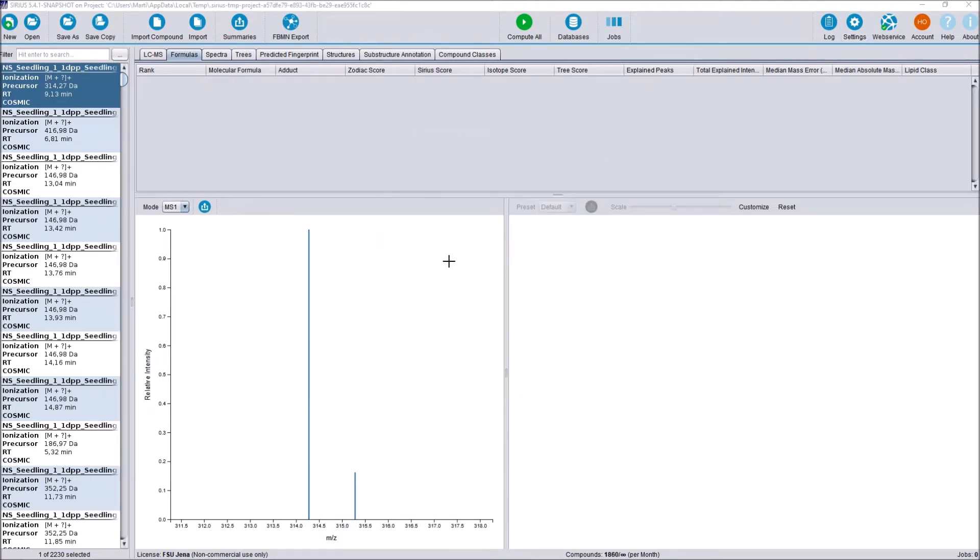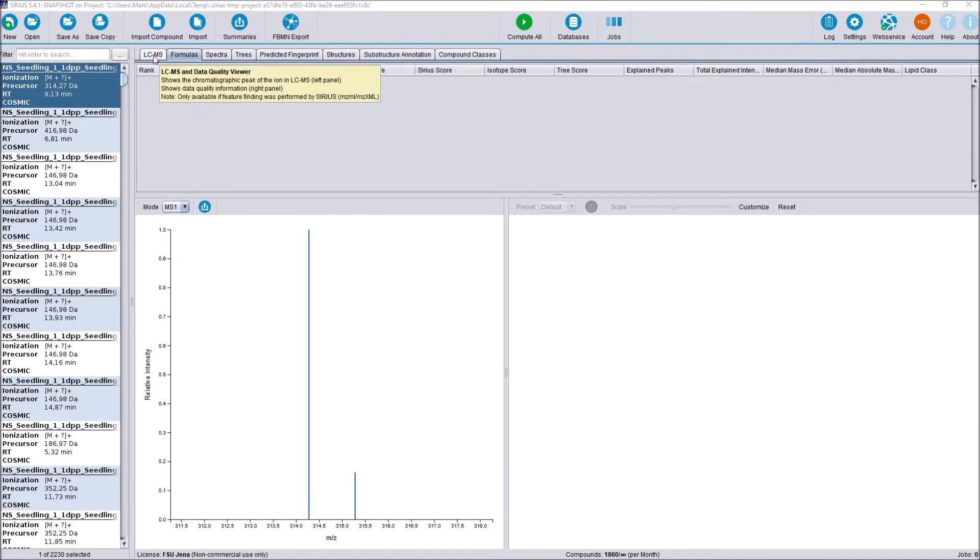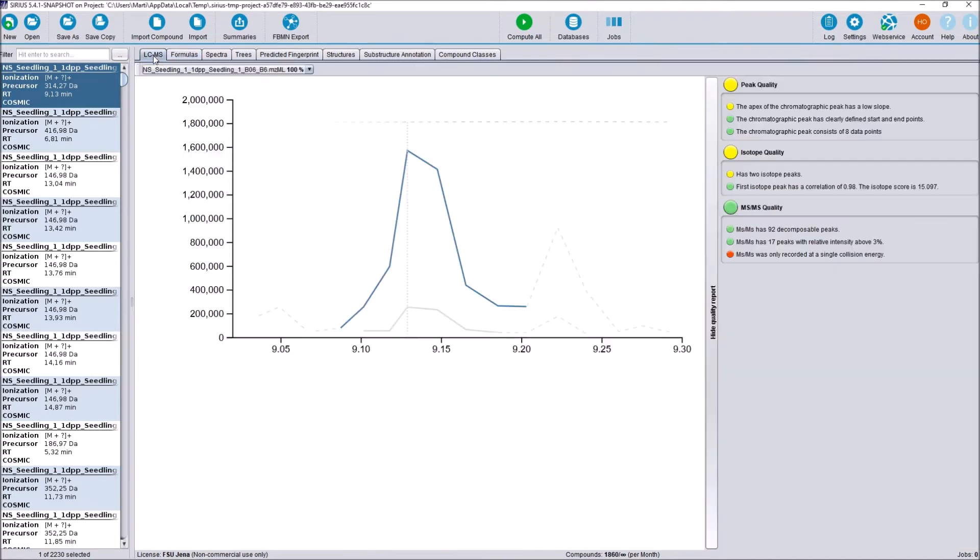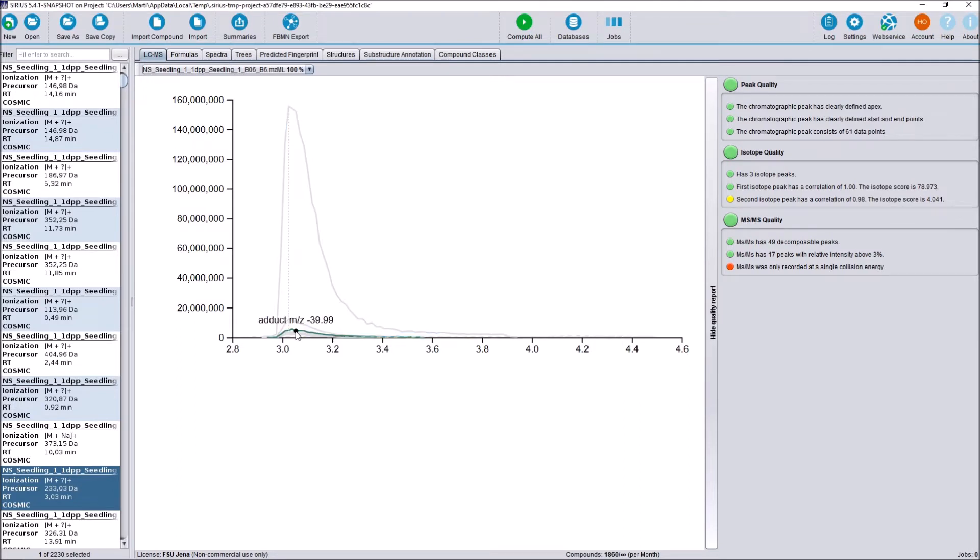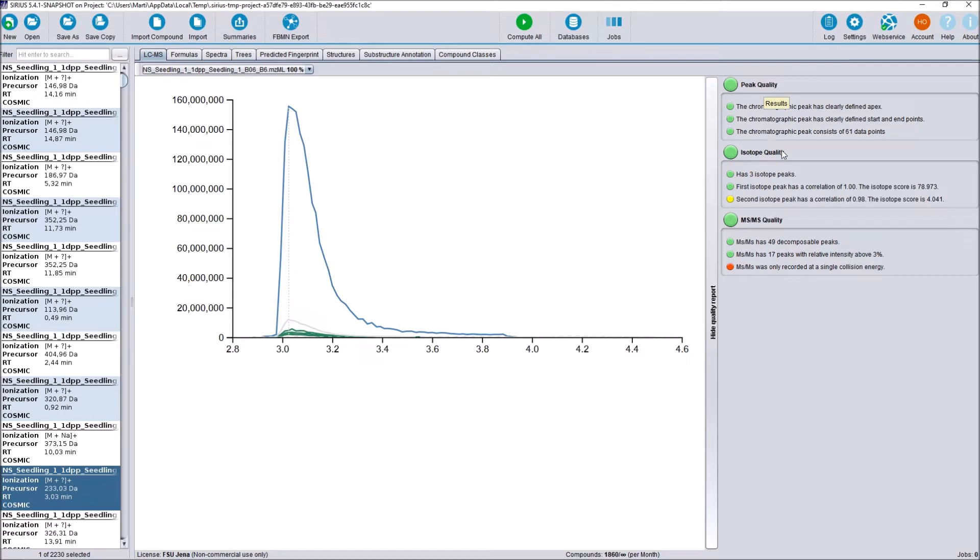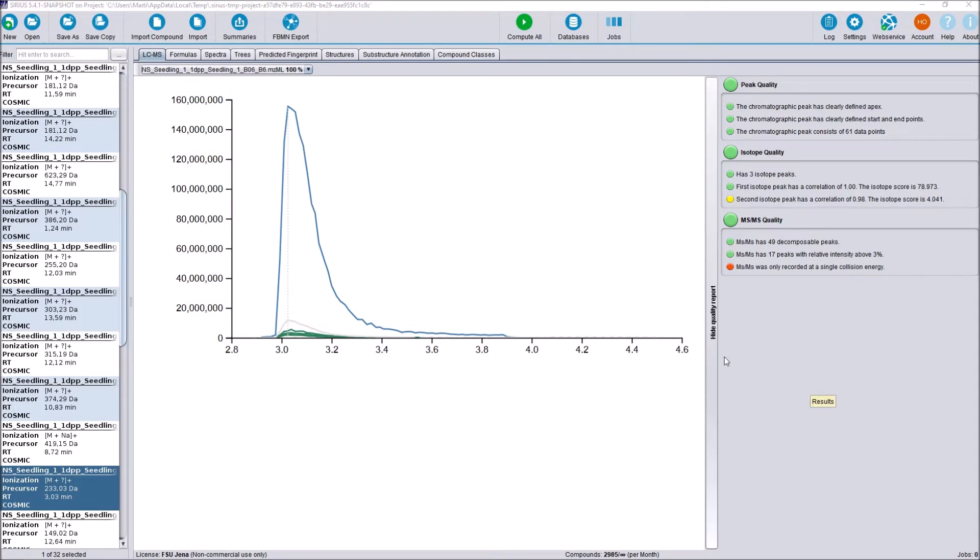Next, we are going to take a look at the new LCMS chromatogram feature, which we can find right here at the LCMS tab. For each compound in our compound list here, we see a chromatogram of our ion peak, of the isotope peaks if detected and of adduct peaks if detected and available. And on the right here, we have a basic quality assessment. We look at the peak quality, isotope peak quality and MS-MS spectra quality. And you can see what metrics are being taken into account here on the right side.